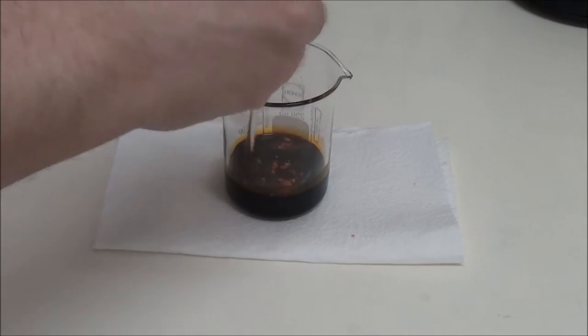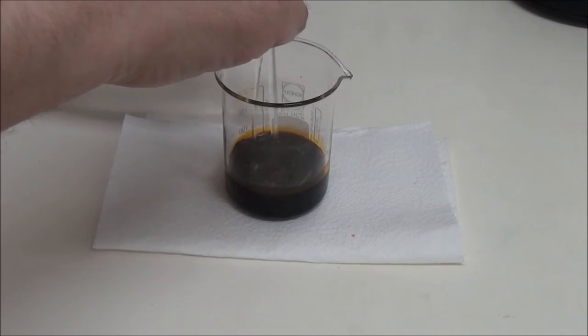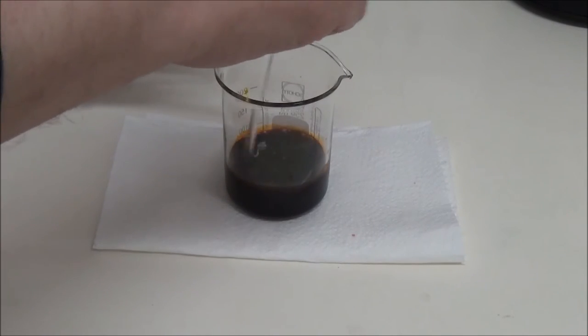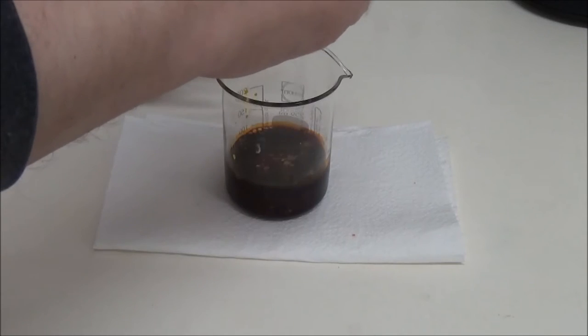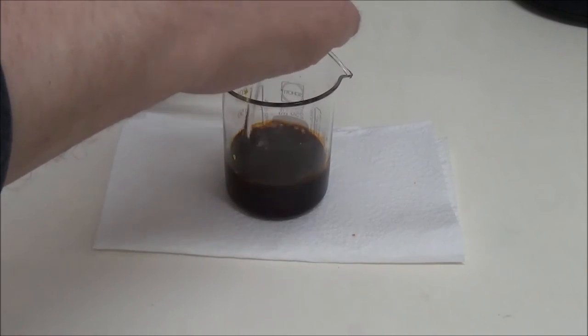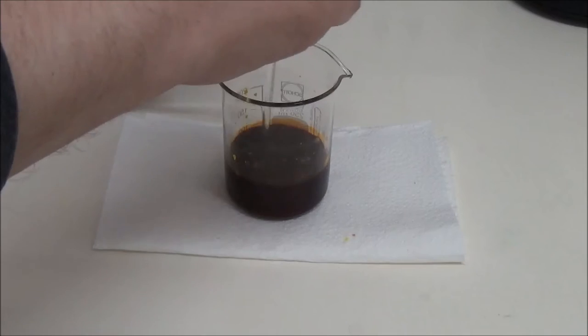Dilute sulfuric acid is then added in portions to the filtrate. A yellow precipitate separates out, which initially dissolves again and again with stirring until the color of the entire solution changes permanently. The sulfuric acid liberates the fluorescein from its sodium salt.